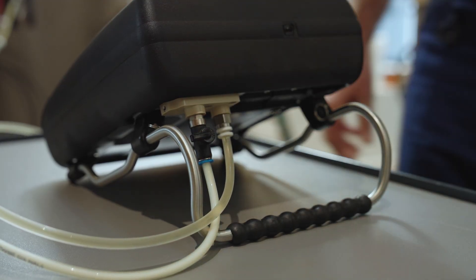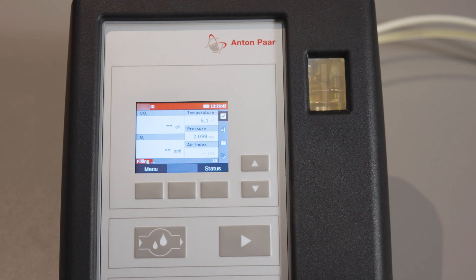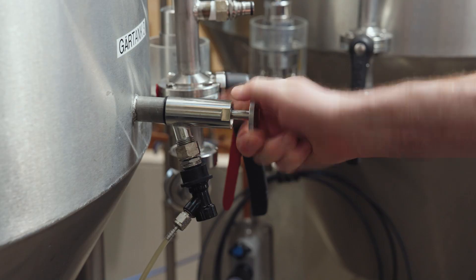Close the ball valve and start the measurement. After the measurement is finished, close the tank sampling valve and disconnect the instrument.